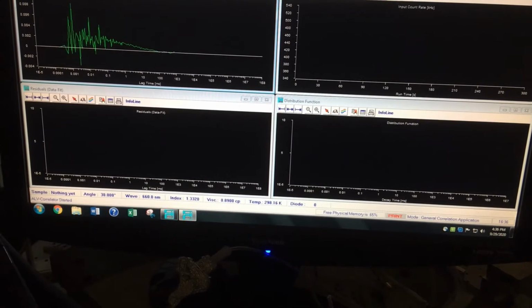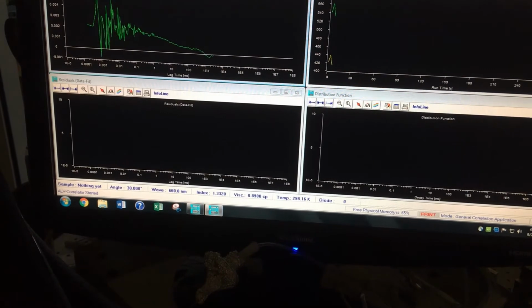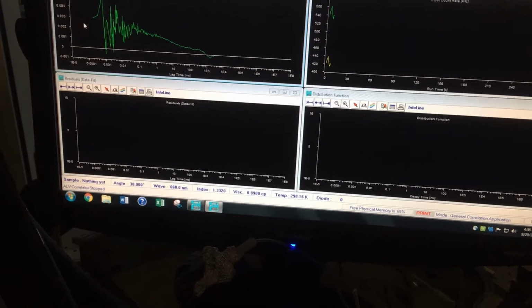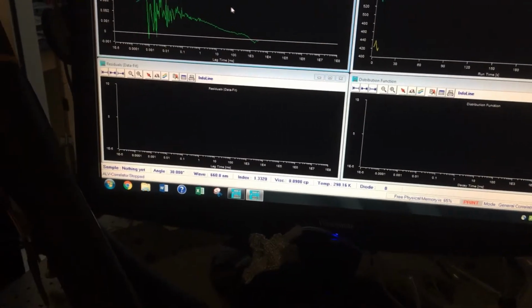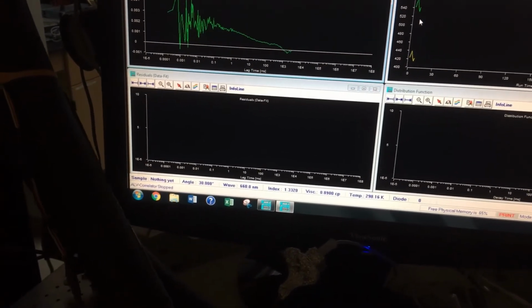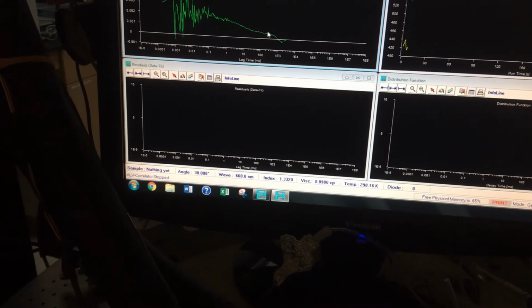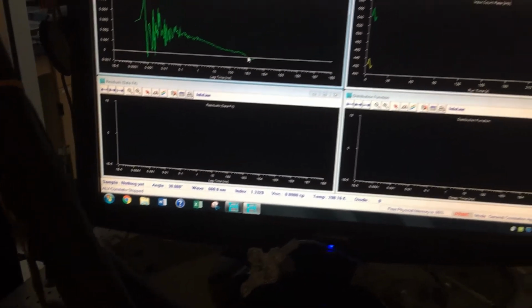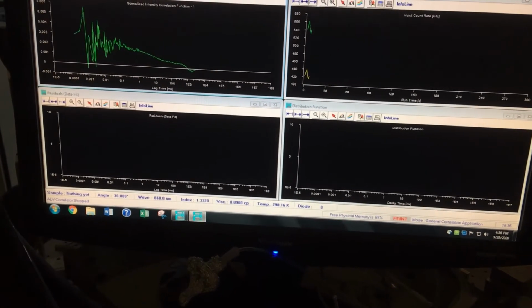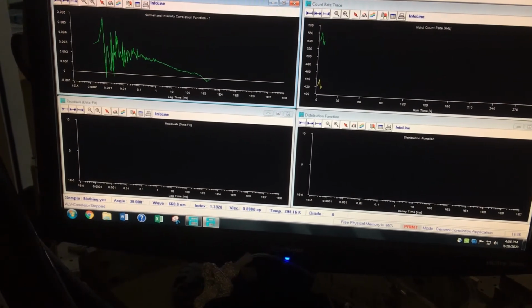And you see immediately that there's signal, but look, it's only barely above the baseline. Look at your y-axis here, 0.002. Because we have pretty high photon count rates, we were actually able to acquire signals pretty quickly, and you can see the decay. But there's some sort of slow baseline drift in this system that we would have to pull out, and that will make the experiment probably would have to be a sum of multiple short runs.